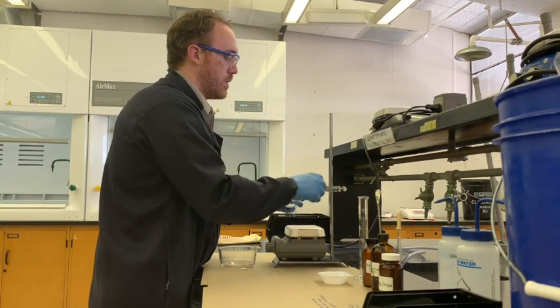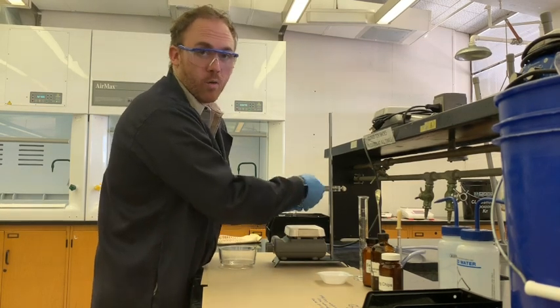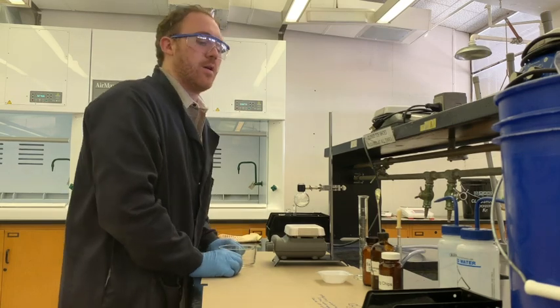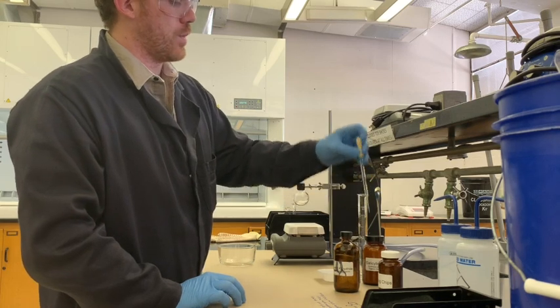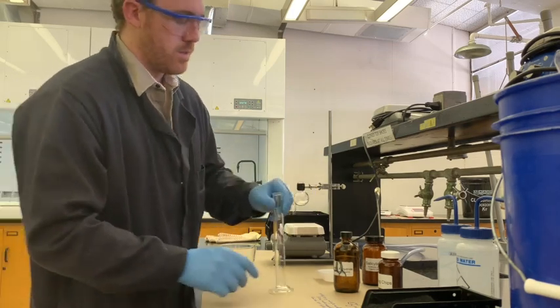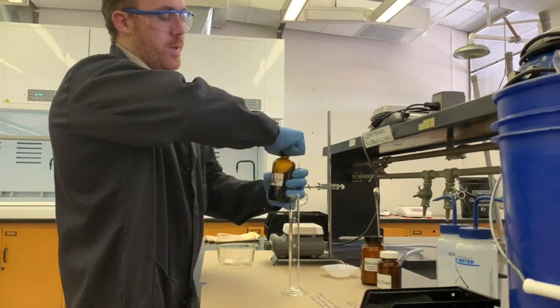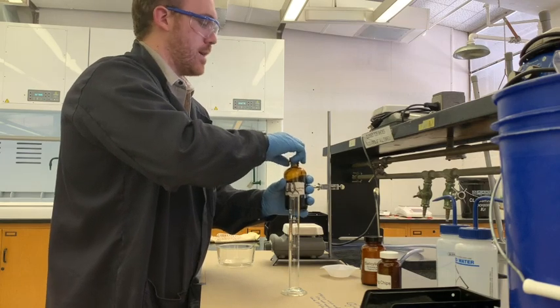Set up the flask and clamp it by the neck - always clamp by the neck for any kind of reaction, not by a condenser or something else, as that's not as safe. Then take some acetic anhydride and measure out 15 mL into a graduated cylinder. You want to be really careful with acetic anhydride; sometimes it's better to work in the hood as it's quite noxious and smells like very intense vinegar.